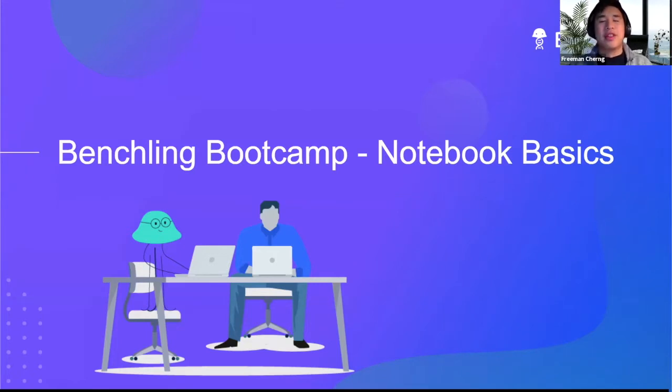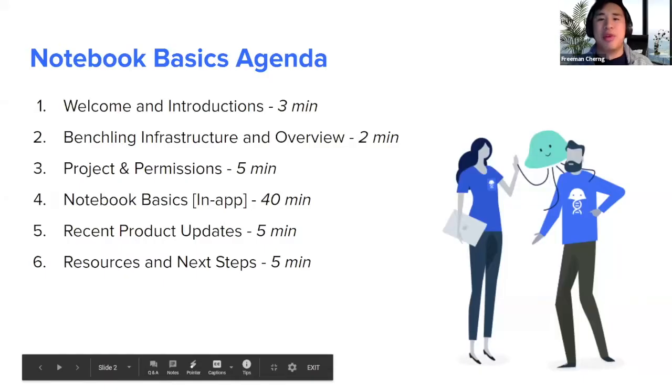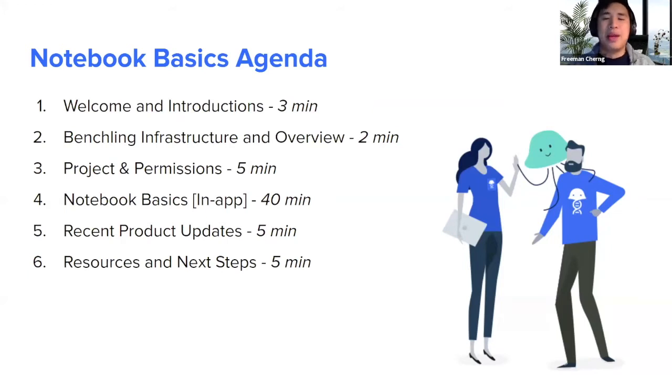Today we'll be going over the basics of the Benchling Notebook. A quick agenda of today's webinar. We'll start out with welcomes and introducing the members of the Benchling team. Then we'll go through some slides that overview the Benchling platform, as well as cover projects and permissions as they relate to the notebook. We'll be spending the majority of our time in platform demoing the Benchling Notebook, and we'll wrap up with some announcements and instructions for you to access our recent product updates, as well as resources to help you familiarize yourselves with the wide range of functionality that Benchling provides.